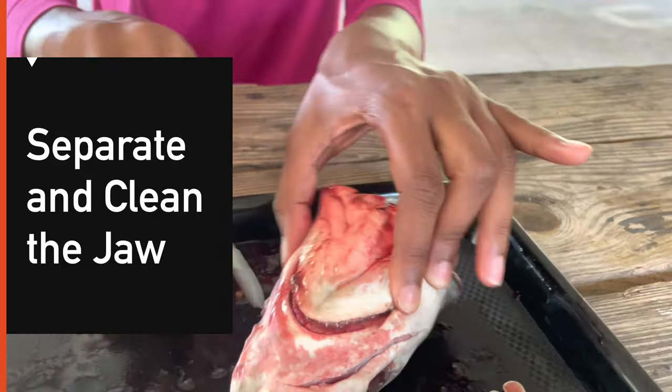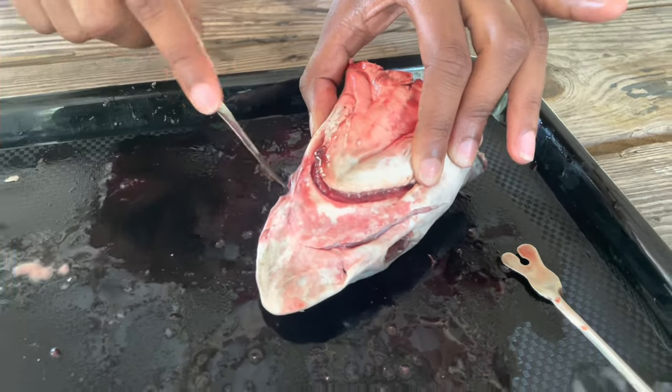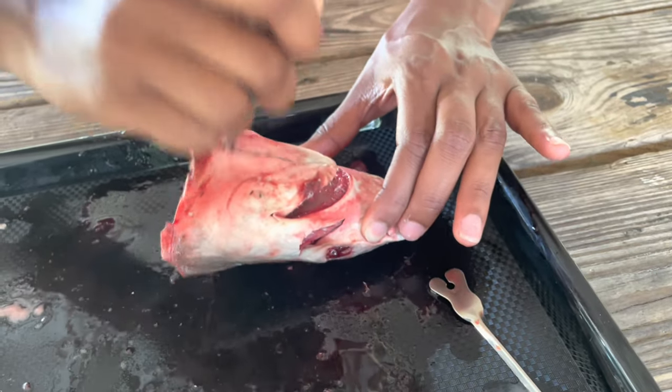The first thing I did was cut the head from the body. This made it easier to handle, given that this shark had experienced some dissections. Here you can see I'm trying to detach the jaw from the shark's head, or chondral cranium.